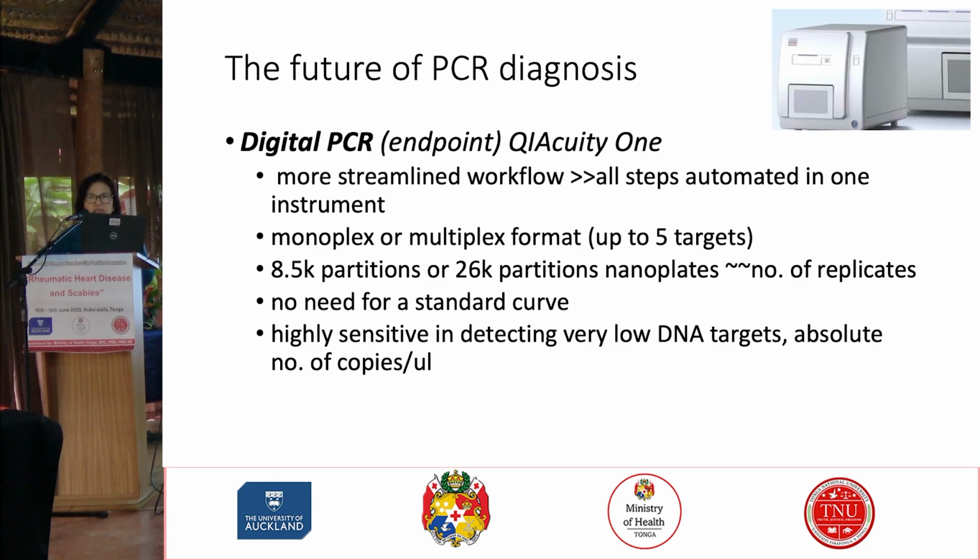It should fall within the control dilutions. And even if I say we can detect less than 1 copy per microliter, we still wanted another technique that can increase our sensitivity more at very low targets. The 3 targets that I'm talking about, SSR5, SSR6, and COX, you can put them in 1 tube and amplify them all at the same time. That is called multiplex format. So if you have 1 sample, you don't only ask for amplification by PCR with 1 target, but you can amplify those targets simultaneously.